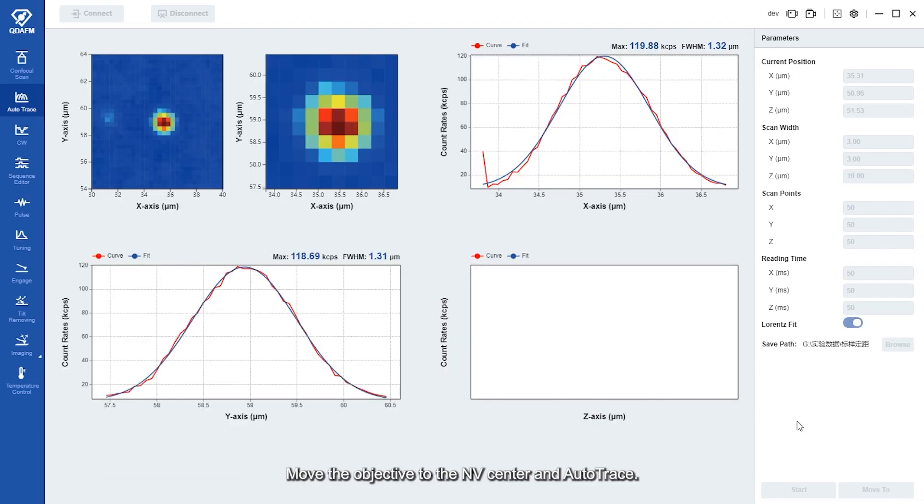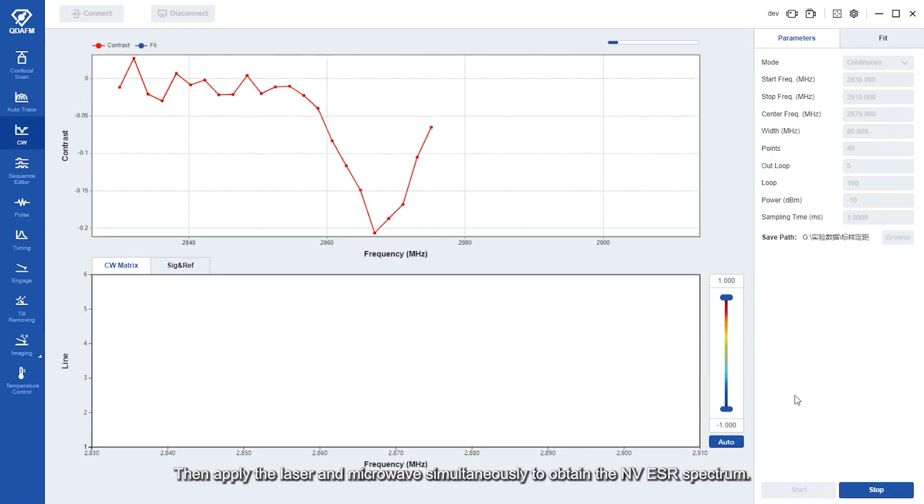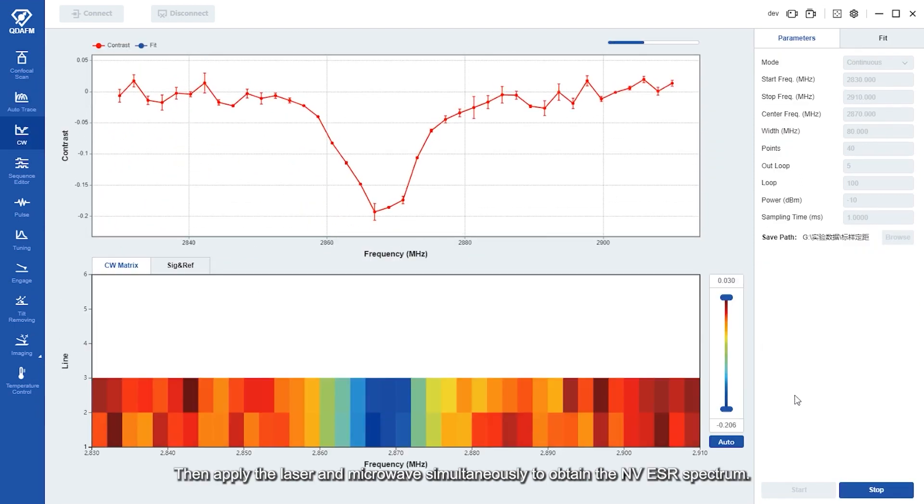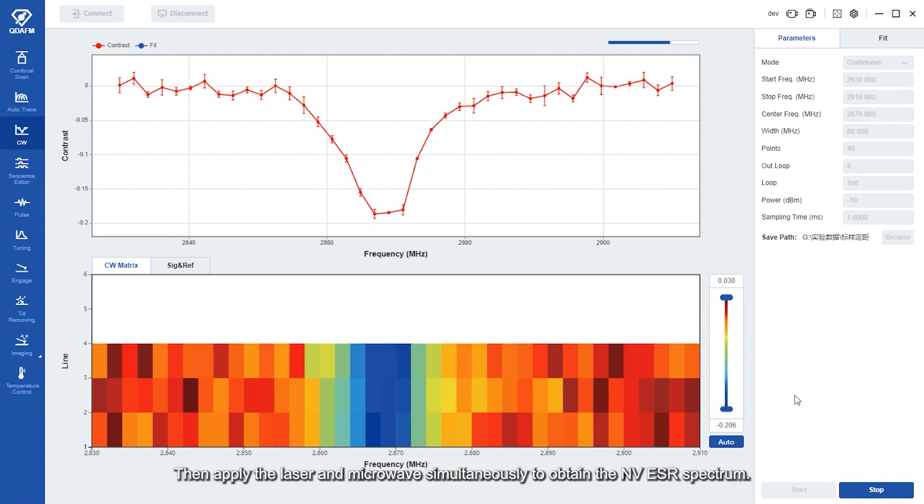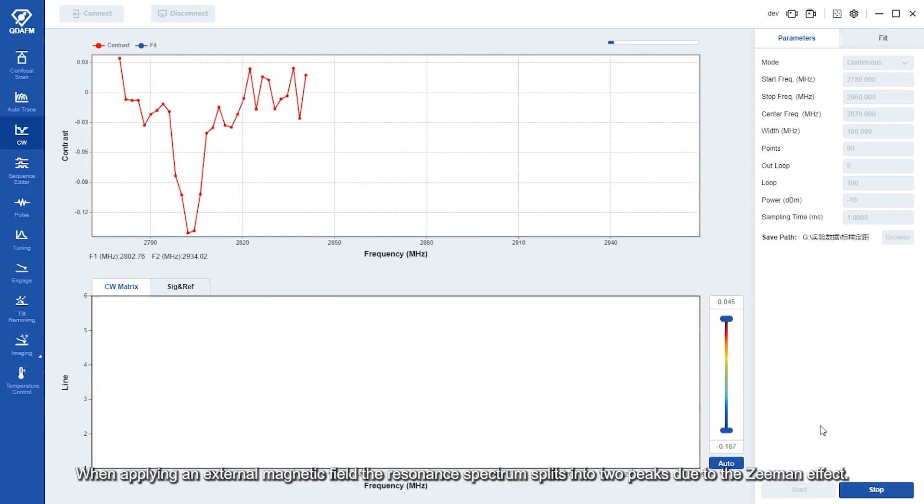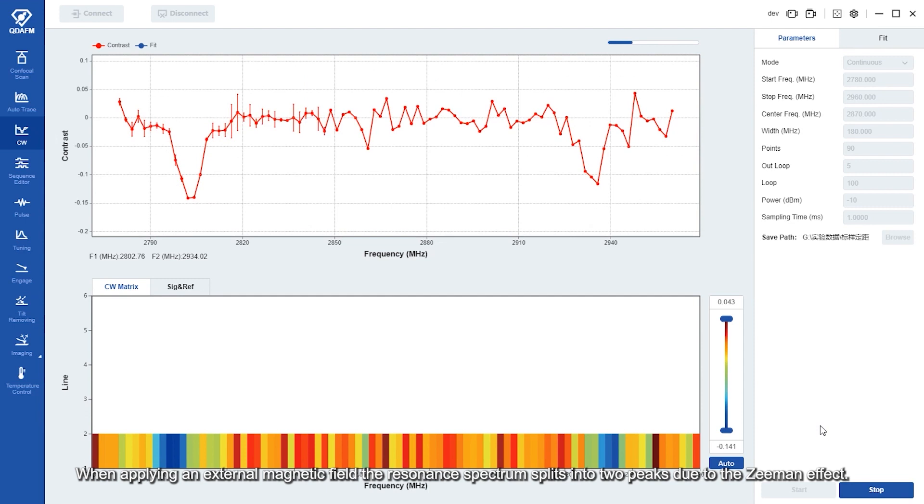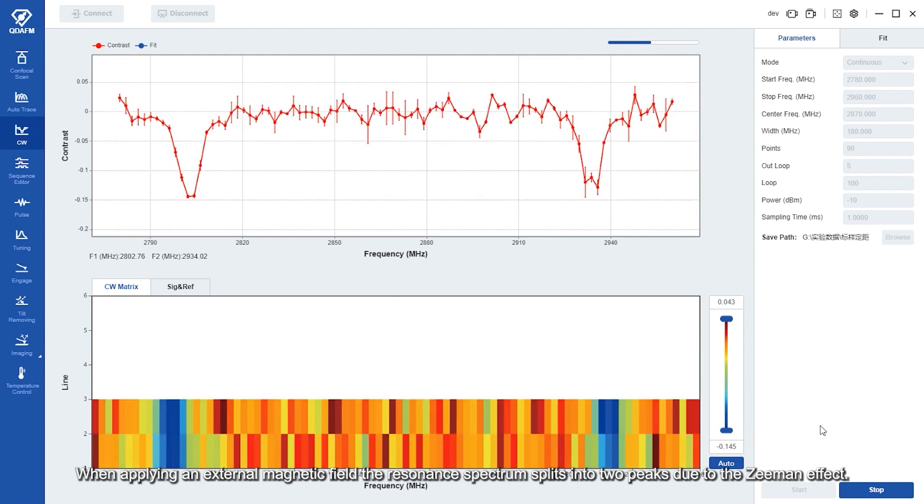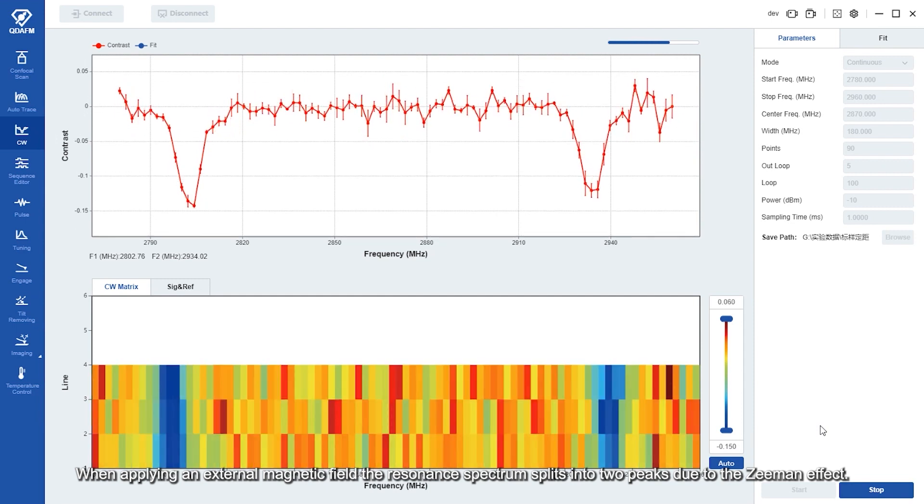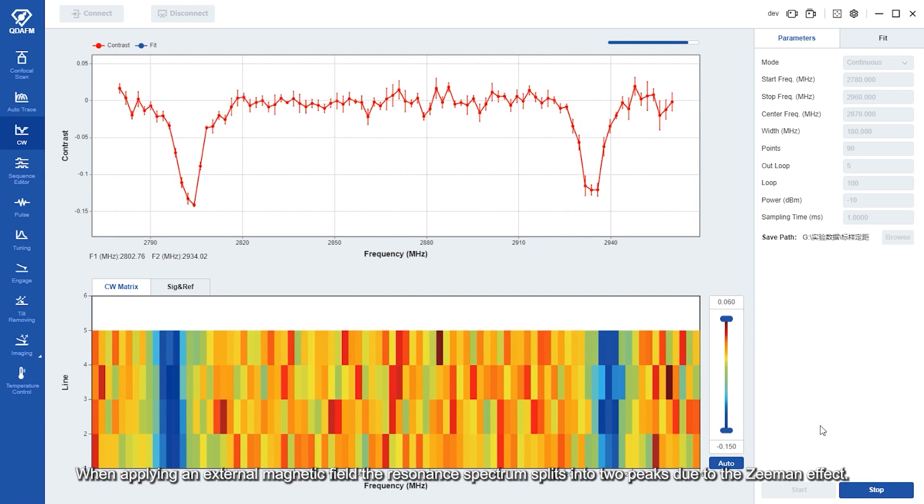Move the objective to the NV center and focus. Then apply the laser and the microwave simultaneously to obtain the NV ESR spectrum. When applying an external magnetic field, the resonance spectrum splits into two peaks due to the Zeeman effect.